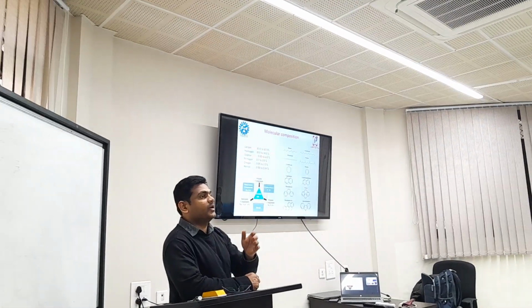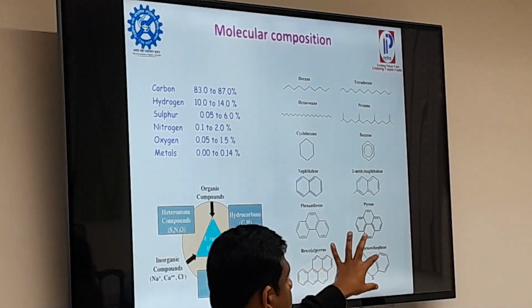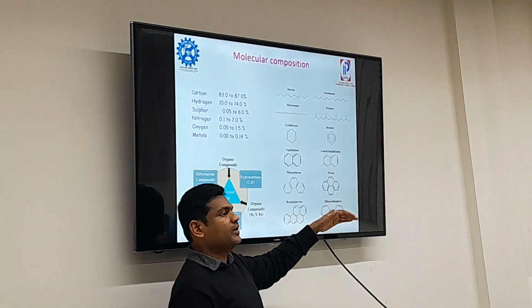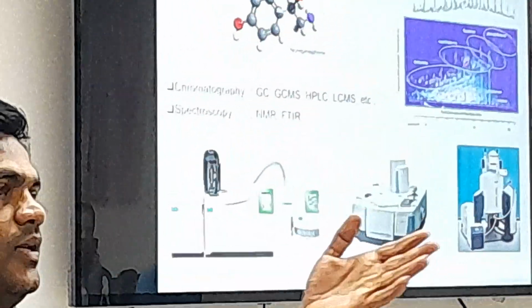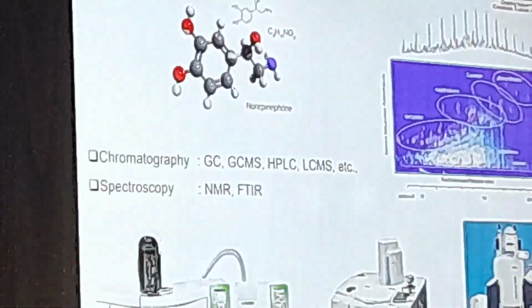Several techniques will come into the question. When multiple molecules come in, we don't use a simple GCMS. We go for very high resolution mass spectrometry. In the US, at Florida State University, you can get it. You can send a sample and get it done.